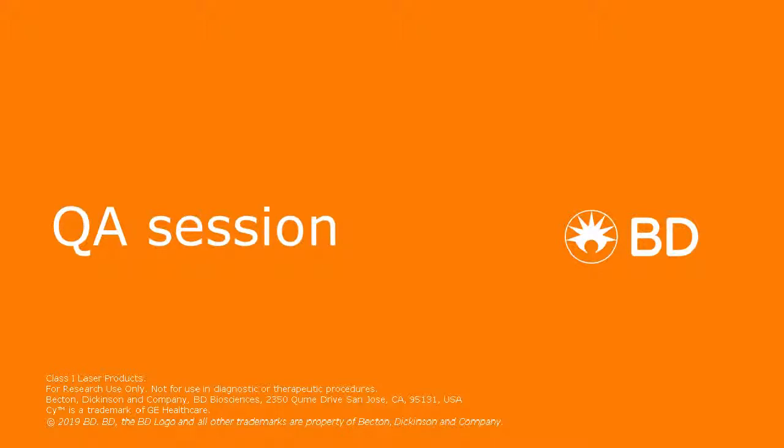As a matter of fact, these panels can be designed on a FACSLyric.